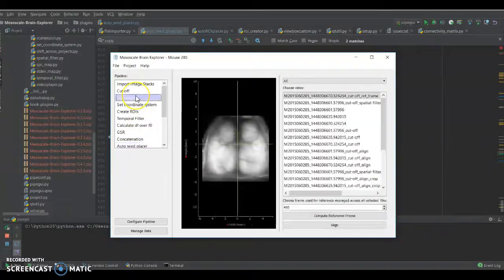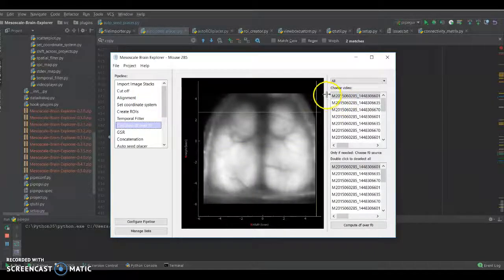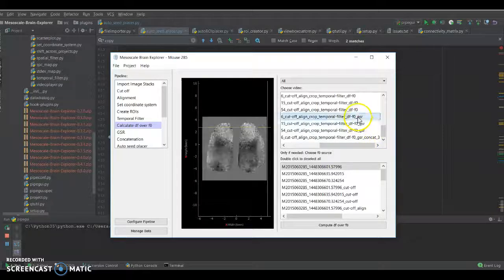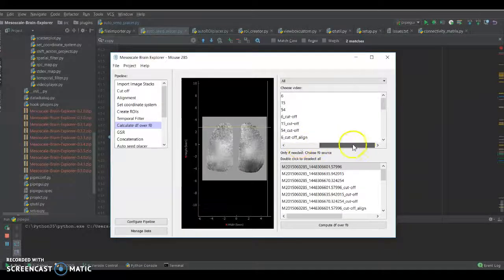A word on what we've done so far before we do that. If you've been following along, you'll notice that all of the files have been saved on the right, and they've been saved to file. Now this may not be a problem for, say, when we only have 3 files. But say we have something like 31 files. Let's take a step further and say each one of these files is a gigabyte large. Then, of course, this starts to get very large very fast.